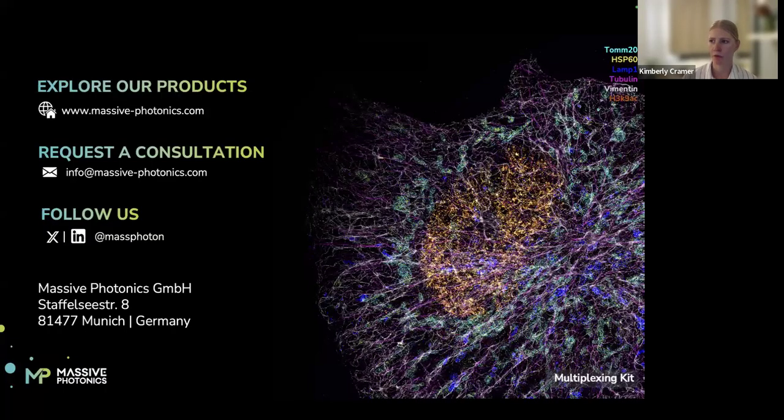And another practicality, of course, is the imaging itself. How are you going to look at all these targets? Do you want to use Exchange-PAINT, where you would then need to do 9 rounds of exchange, so 9 rounds of washing in between the images? You can do this manually, or you can do a microfluidic system. So these are the questions you would want to ask yourself.